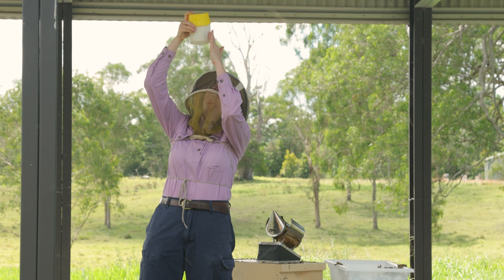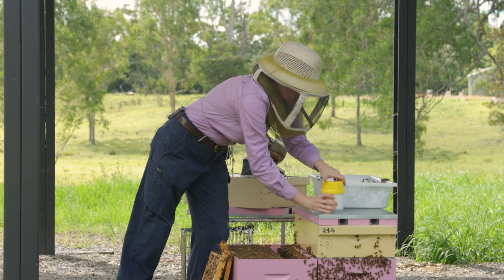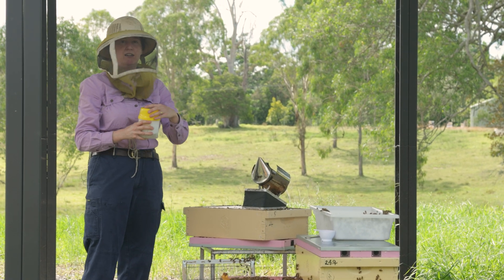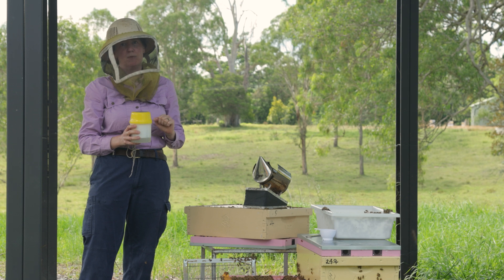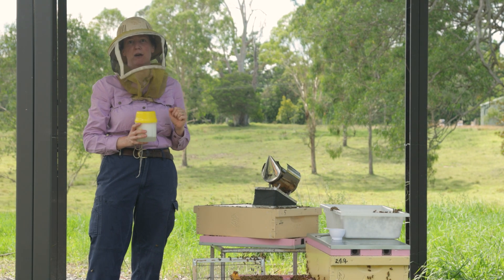Having a look — still only seeing two varroa mites in that sample. At this point I can close up the hive, take this sample away, and dispose of it accordingly. Recording my two mites found in that sample from my soapy water wash and keeping that in my records.